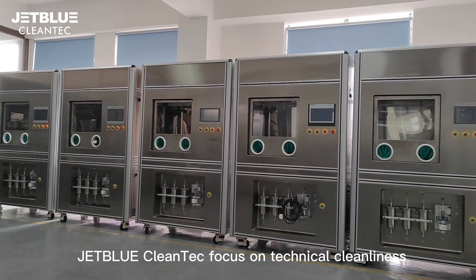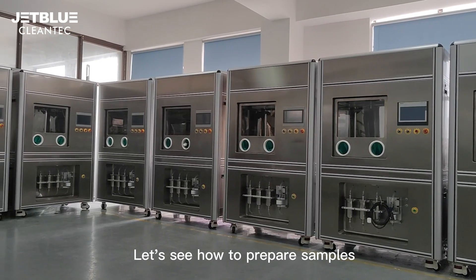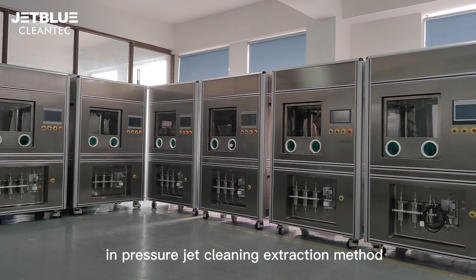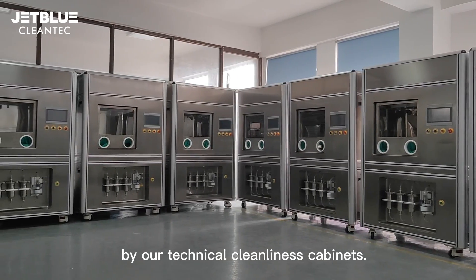JetBlue CleanTech focuses on technical cleanliness extraction systems and analysis. Let us see how to prepare samples in the pressure jet cleaning extraction method using our technical cleanliness cabinets.